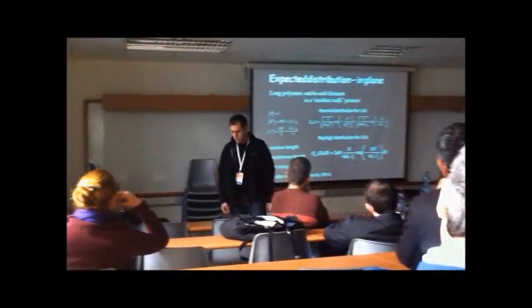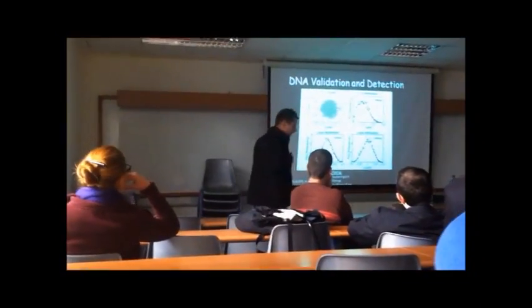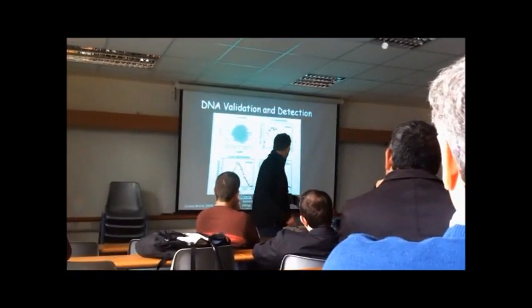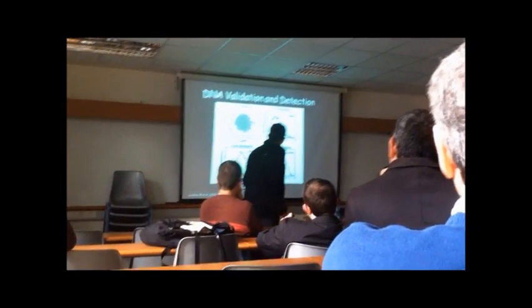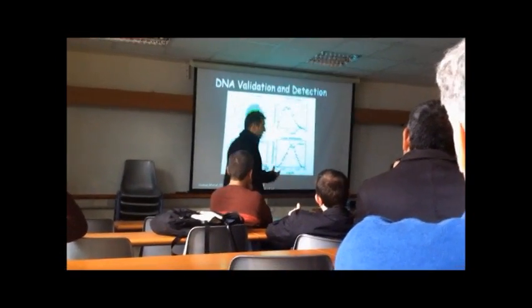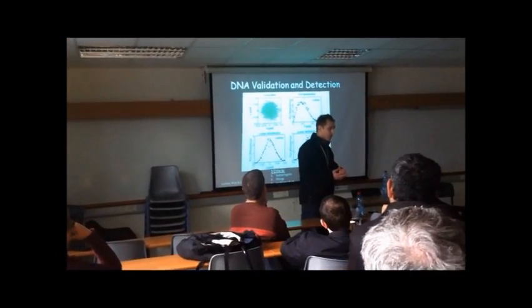See the derived distribution. So I showed you before the slide, and I told you here now we have a tether and everything is cool, but we have to actually validate that everything is okay with our measurements, and we have a correct DNA that is tethered according to what we think.